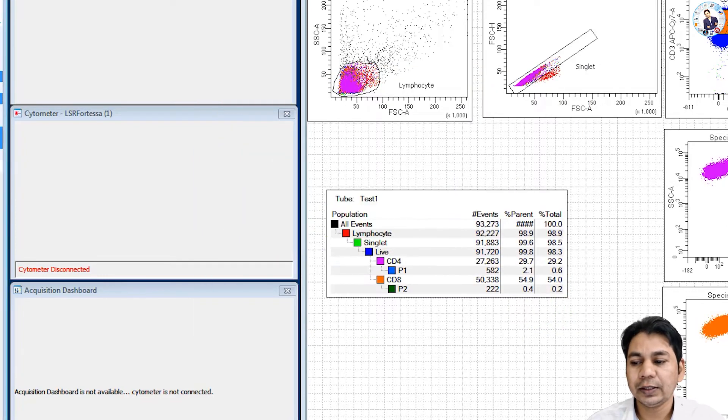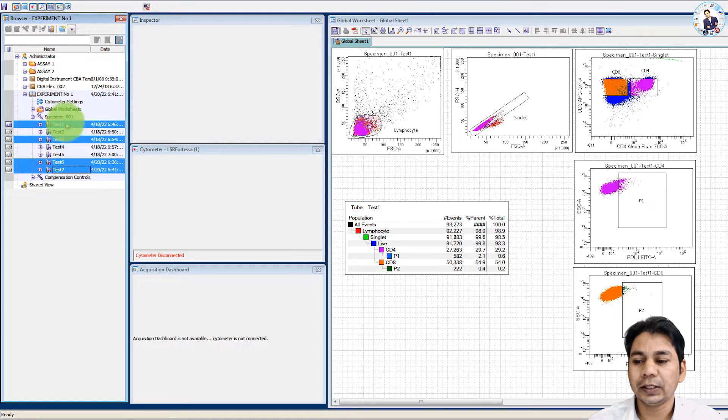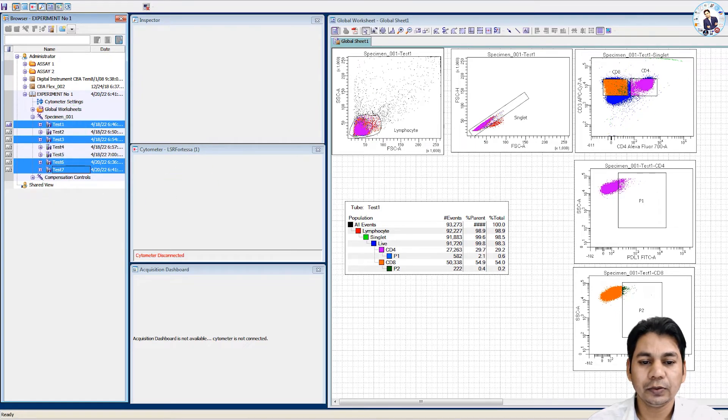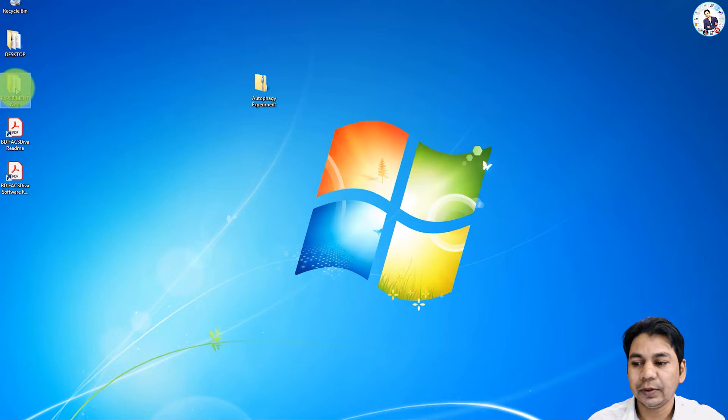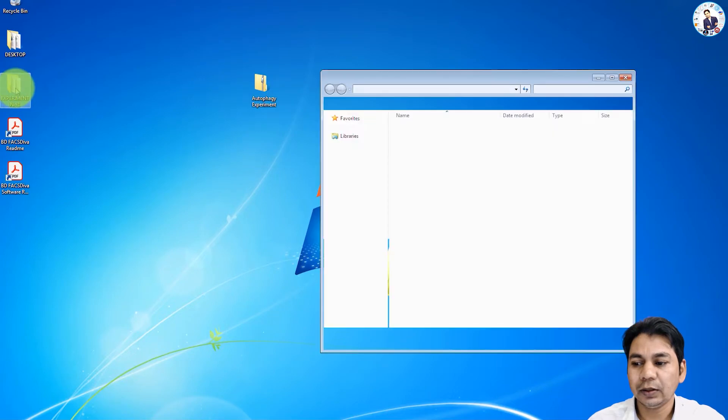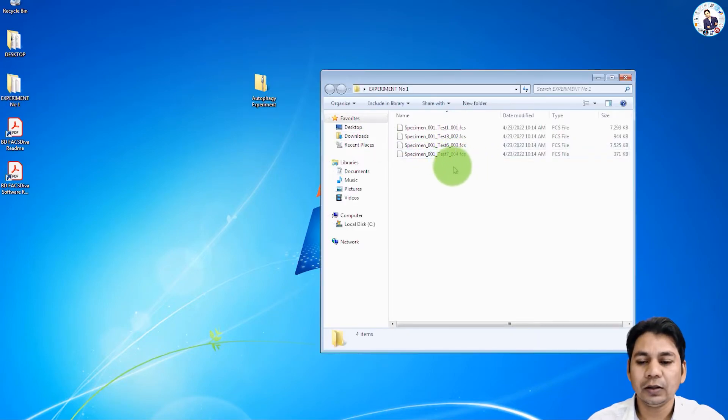Here you can see I have selected four files in the FCS Diva software and after export, it makes a folder with the experiment name, experiment number one. If you open this, you can see all four files are present here.